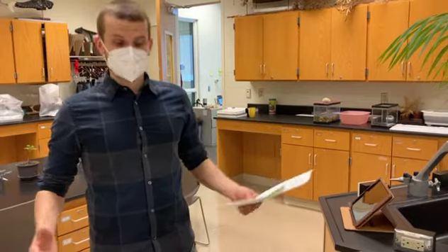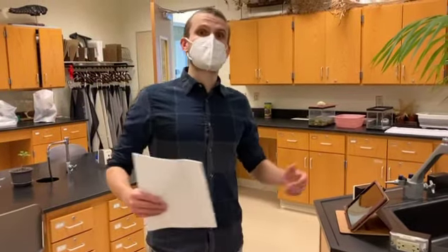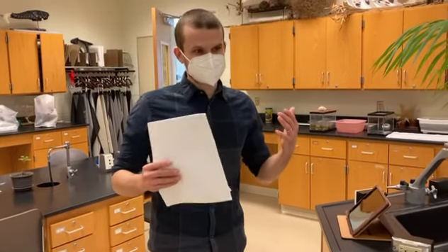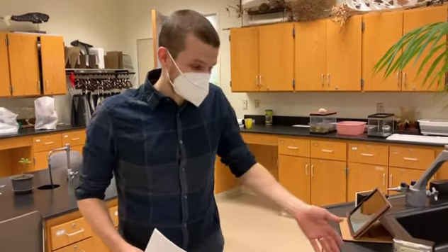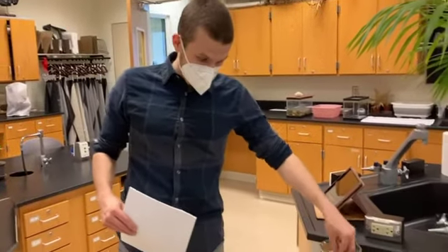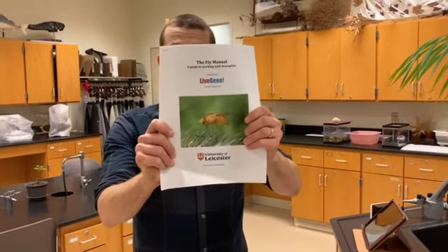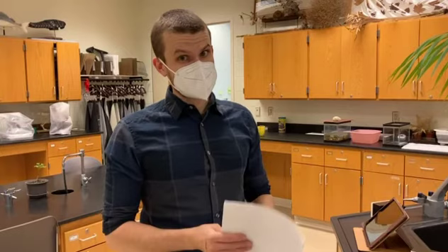Hey everyone! So here we are with lab number 3, our crosses lab. Today it's a lot of drawing things, not drawing as in illustrations, but drawing samples from a pool and seeing how that plays out with the genetics. We're going to be working with the genetics of the fruit fly, Drosophila melanogaster.